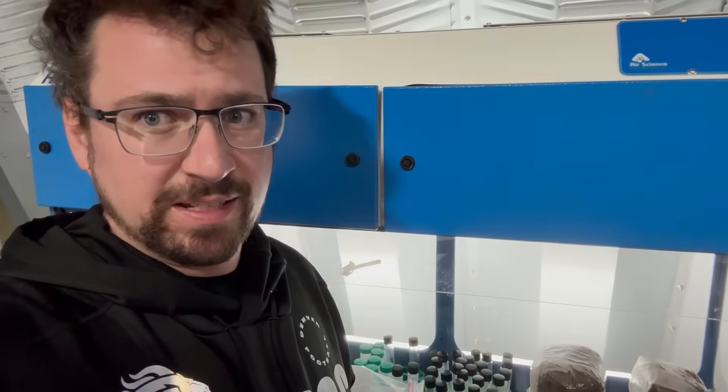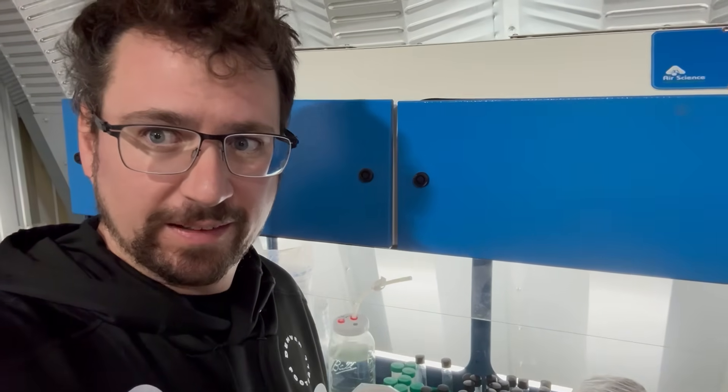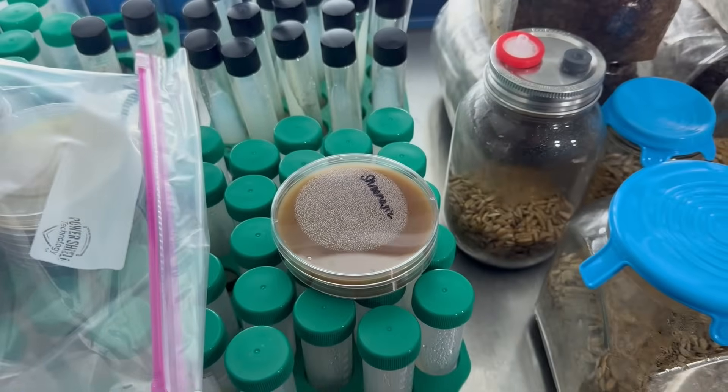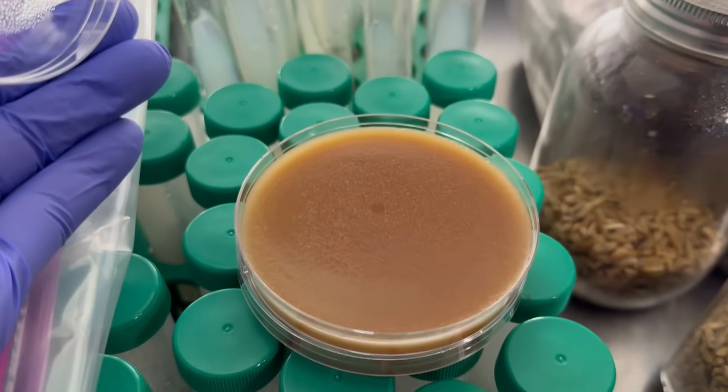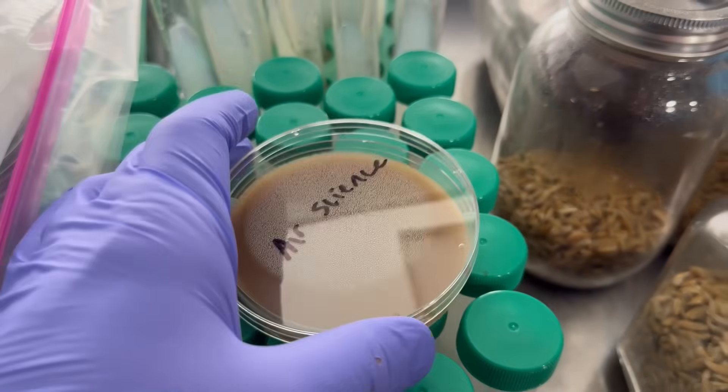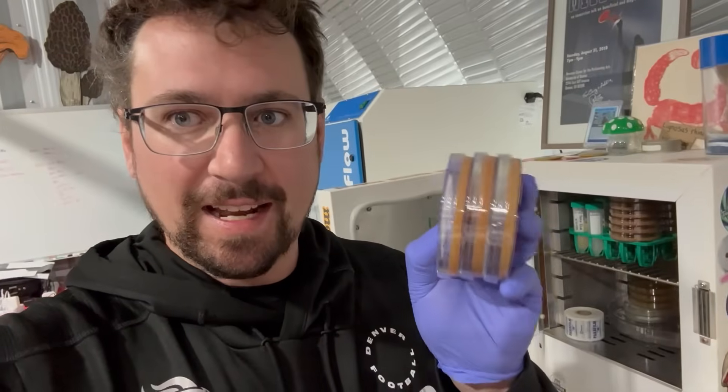It's been 72 hours since the experiment. Let's check our plates. Everything looks super clean right now. I'm going to leave these in for a few more days to see if we get any growth. Usually yeast or bacteria will show up within the first three days, and sometimes spores can take a couple of weeks to germinate. My lab is very clean here, so I didn't really expect any growth, which is good. I'll see if anything comes up on the ambient plate over the next few days.